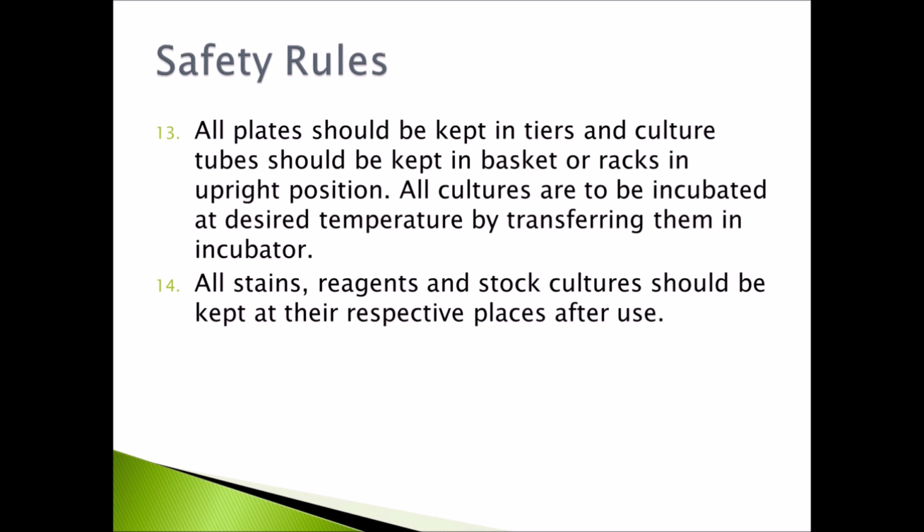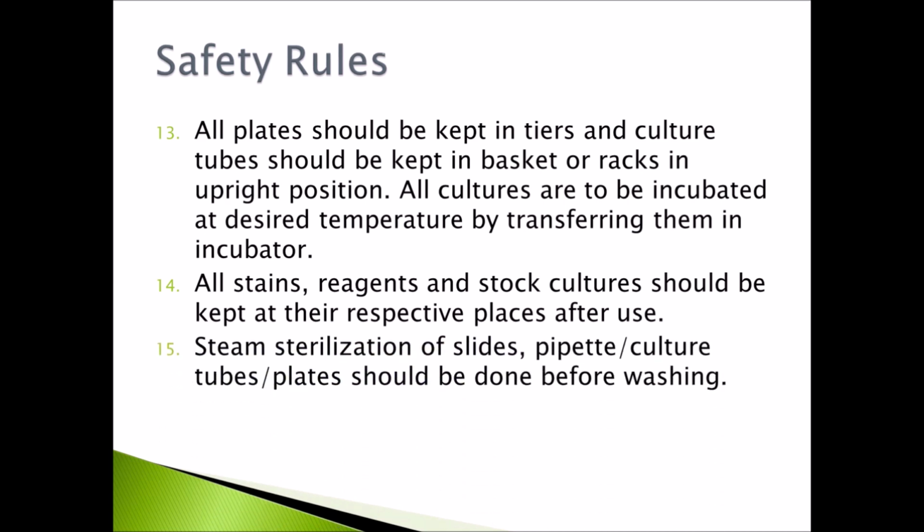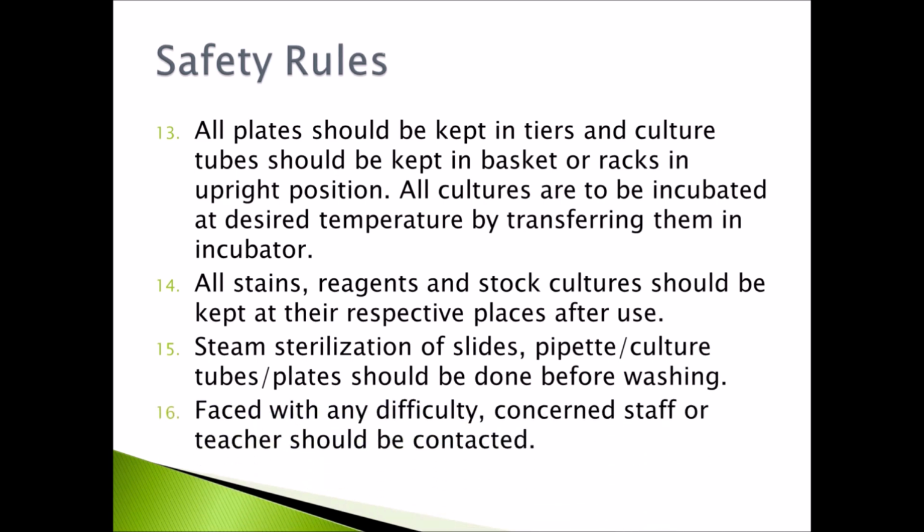All stains, reagents, and stock cultures should be kept at their respective places after use. Steam sterilization of slides, pipettes, culture tubes, and plates should be done before washing. Faced with any difficulty, the concerned staff or teacher should be contacted. So, all these are safety rules, and now precautions.